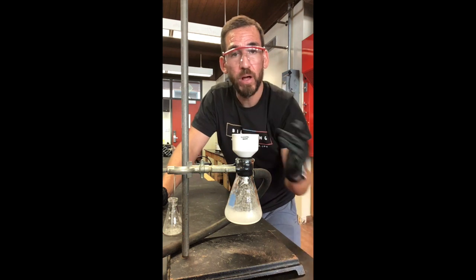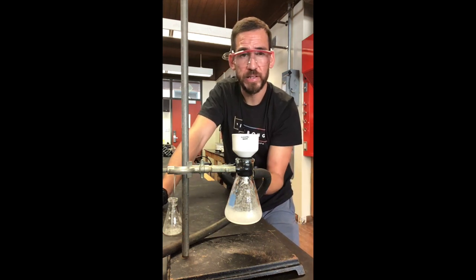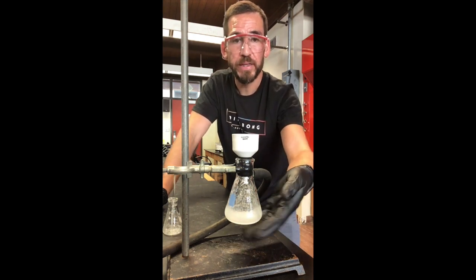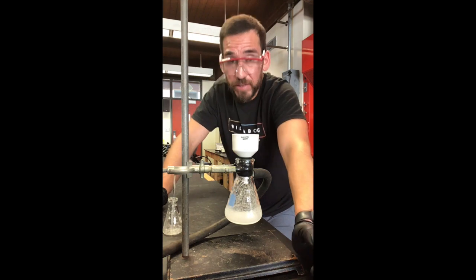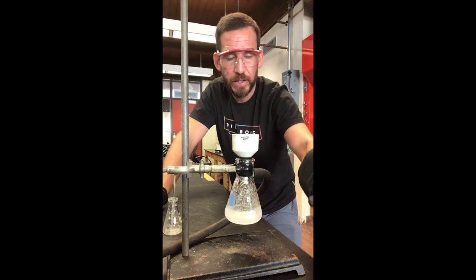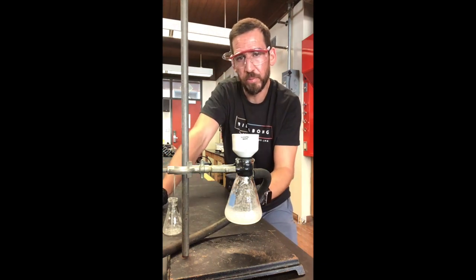But really all I want you to gather from this is the process of recrystallization. And then, you saw me pour it off. Now I'm going to let this hang out here for about 5 to 10 minutes. And what we're going to do is take a look at the final mass to determine how much we obtained from that 508 milligrams that we started with, okay?